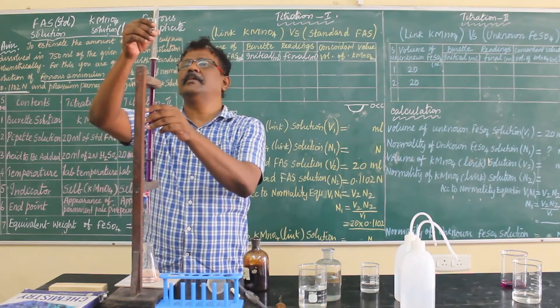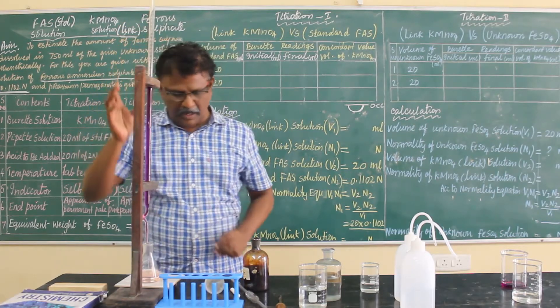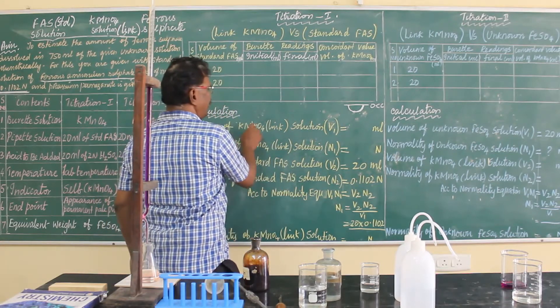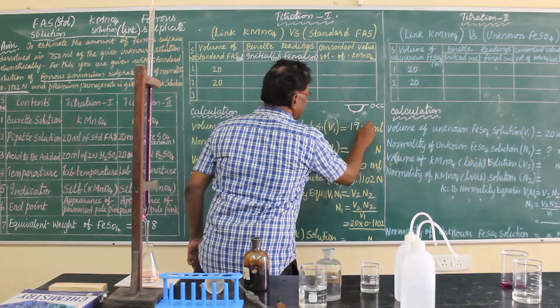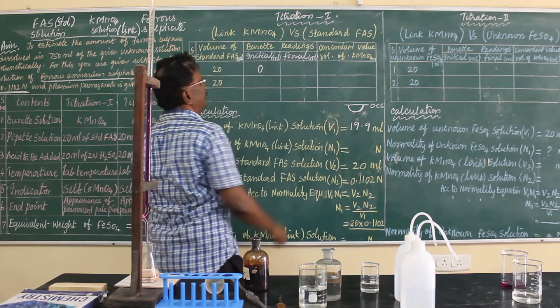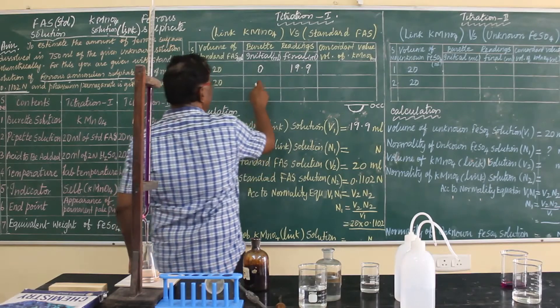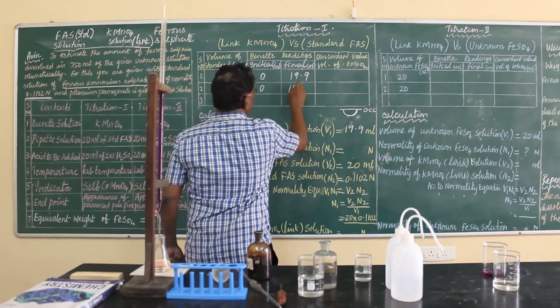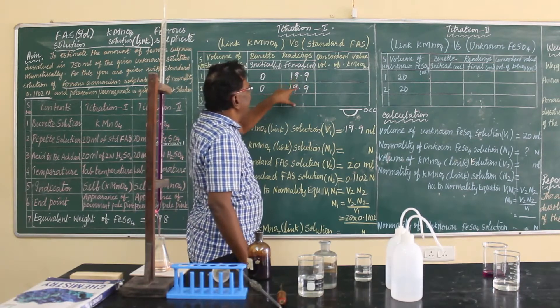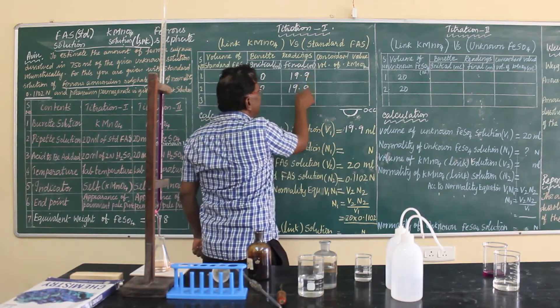Note down the endpoint. The endpoint is exactly 19.9 ml. Initially I took zero ml and finally reached 19.9. The second time I repeated the titration, I got the same value — 19.9. You should get the same value consistently across titrations, and I am getting the same value in both the first and second titrations.